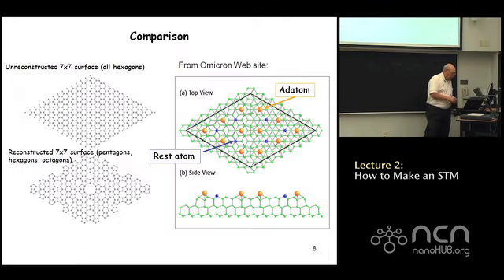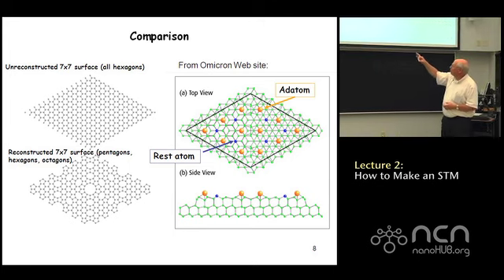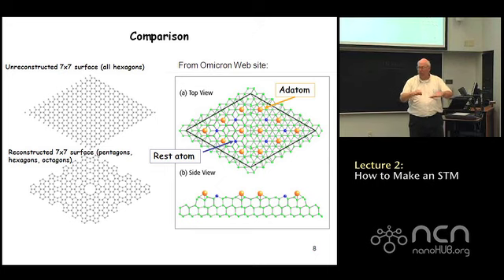Experimentally, it's a lot more complicated than that. Again, I just try to make the case that now, because of the STM images, we know exactly where each atom is on the surface, in great detail. And it turns out you have to go 3 layers deep in the surface to completely understand where all the atoms go. So when you create that surface and you anneal the surface, the atoms are going to move to their lowest energy configuration. That always happens. And how they move, they buckle up, they move down, they spread apart. How that moves is really complicated.